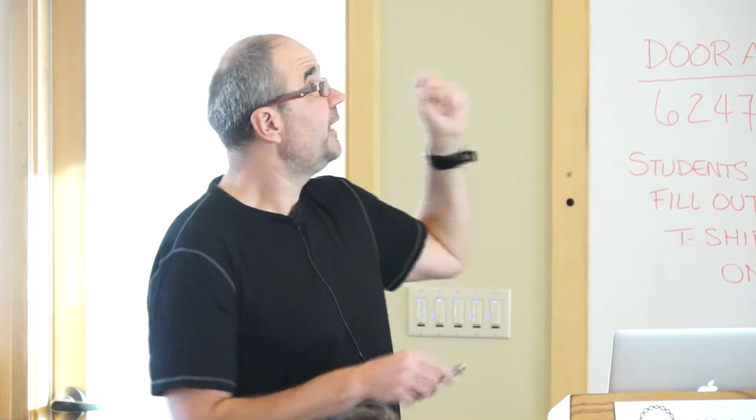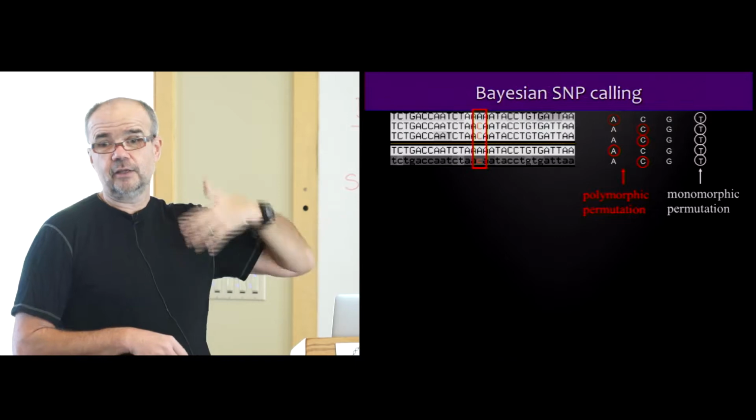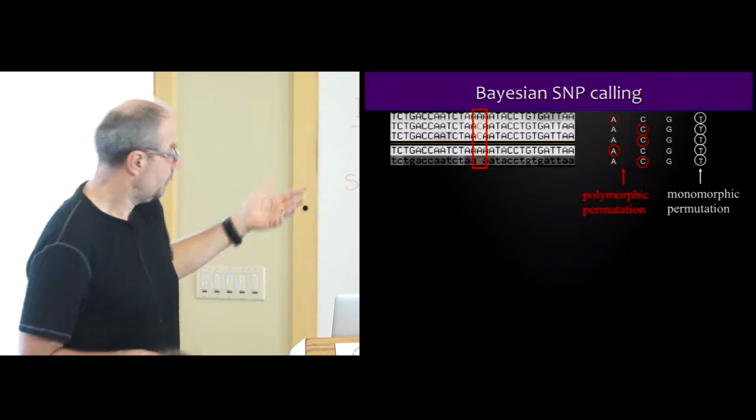If I look at 1,000 bases in a human genome between two individual human chromosomes, how many variant sites would I see? One, about 1 in 1,000, right? So without knowing whether a site is polymorphic or not, a priori, if I was a betting man, I would bet 999 against 1 that it's not a polymorphic site, okay? So we need more evidence. We have to have enough evidence in the sequences to overcome that prior expectation, okay?